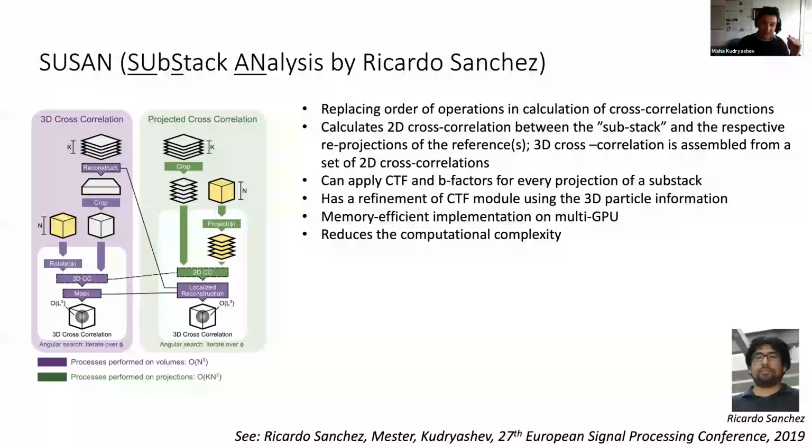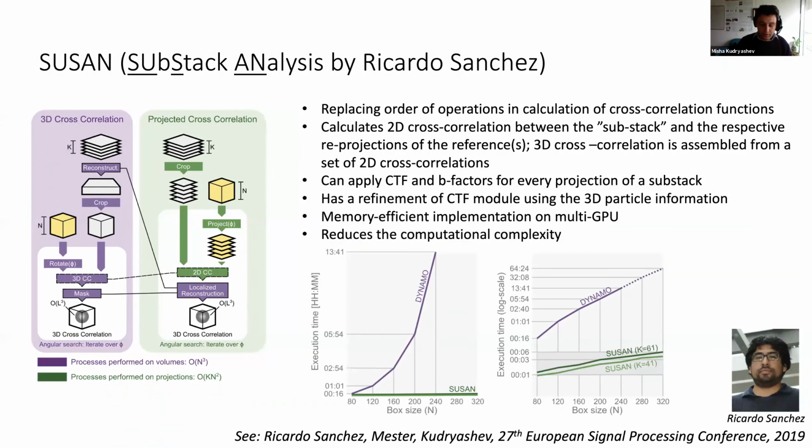implementation. So essentially, he never needs to extract the particles anymore, because he can load the tomogram in the memory of the graphical processor and on the fly extract all the particles from it. And if you have, let's say, 10,000 particles in a tomogram, which I'd love to, then you essentially do not need to generate any additional files. This is very quick.